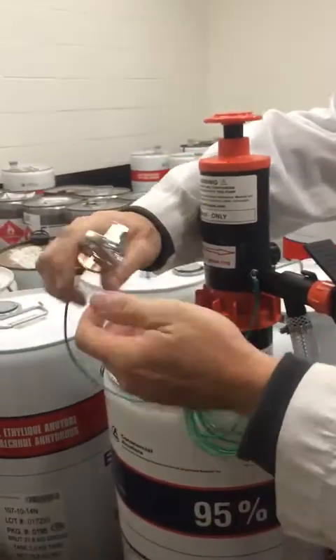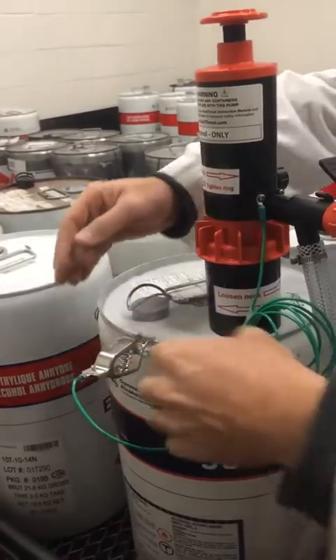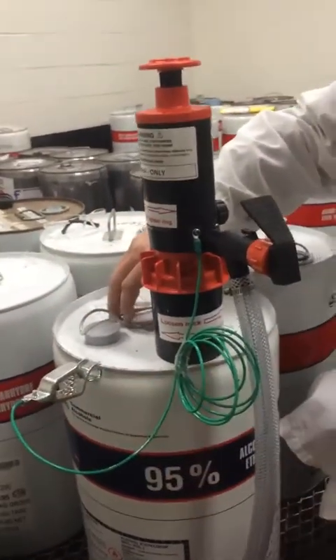Then you take the grounding wire and attach it to the drum lip. This is going to prevent any sparks from happening.